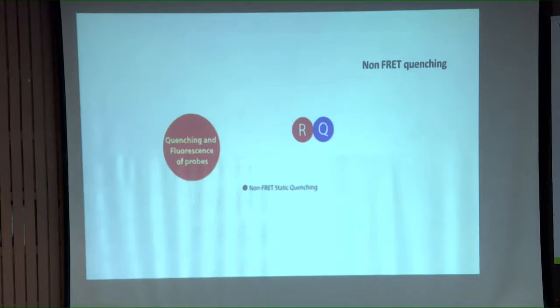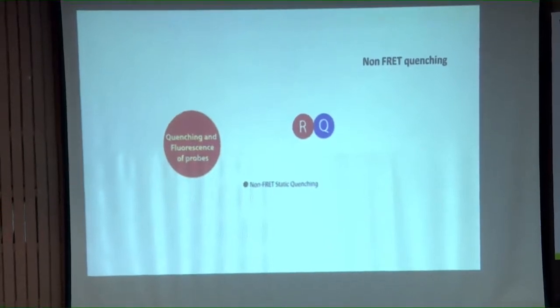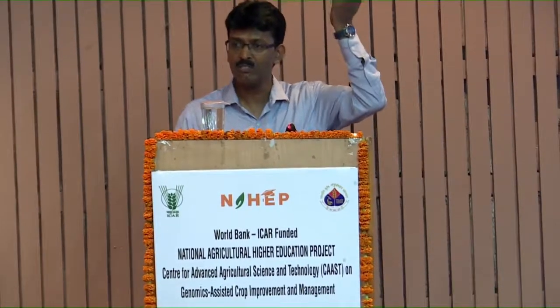Just now I told you, the 5' to 3' exonuclease activity of the very same enzyme which is used in DNA polymerization. That's the beauty of the whole technique. You are not adding something new here. It is the same enzyme which does the polymerization, the same thing which is happening for removing the probe molecule, which is composed of three chemicals. One is reporter, quencher, and the nucleotides ATCG, right? So non-FRET quenching is exploiting the property that as long as these two molecules are in close proximity, fluorescence cannot happen. When they are removed from each other, it emits fluorescence, right?